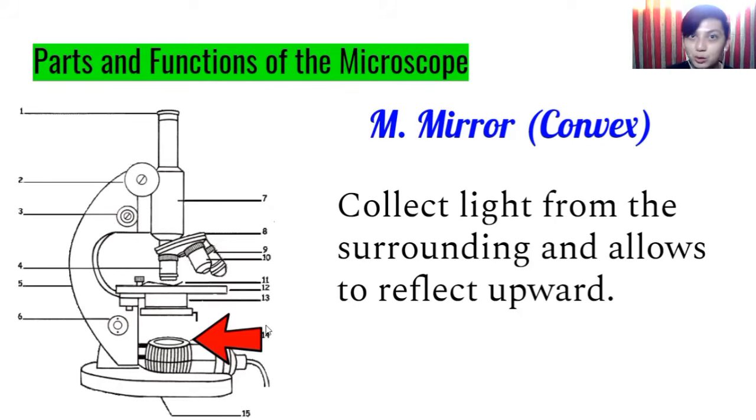Mas madaling mag-capture ng light. Okay, naka-convex siya. Okay, and concave. So it depends kung anong gagamitin nyo doon. Meron tayong concave mirror, meron tayong convex mirror.